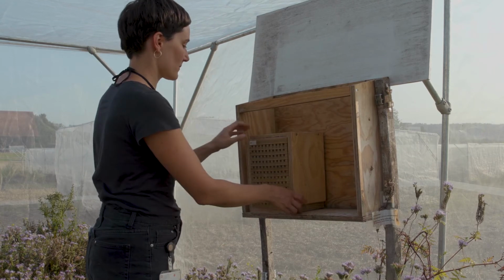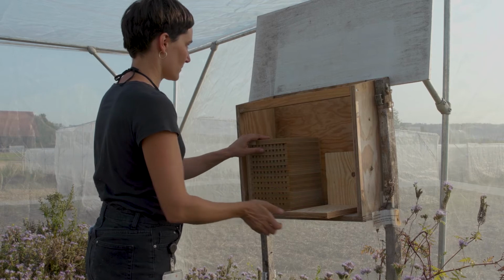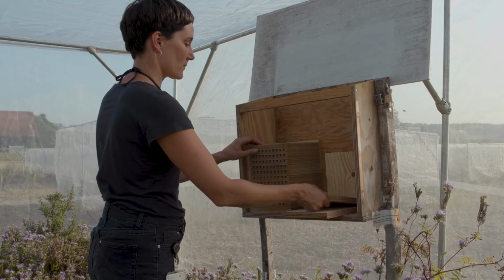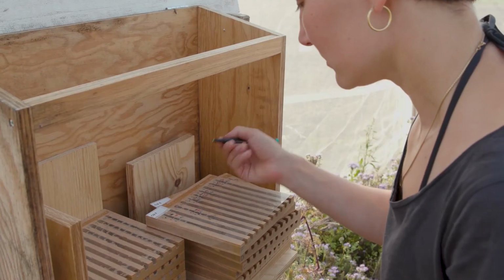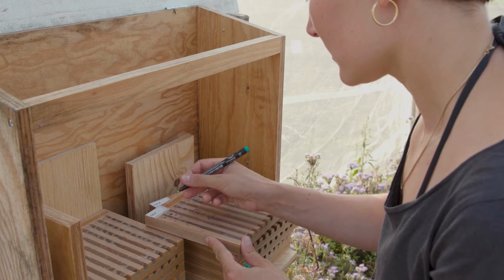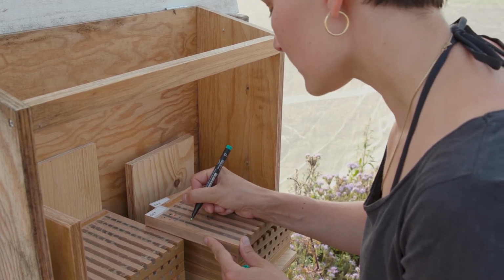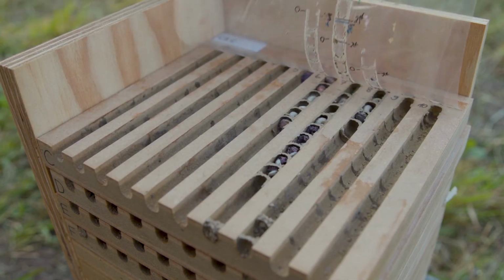The nesting unit is composed of wooden layers which can be assembled to a block, each layer containing 10 nesting cavities. The cavities are semicircular and open at the top, which allows to look inside the nest and observe nesting progress and offspring development. A plastic foil covers the layers and protects the nesting females and brood from disturbances.